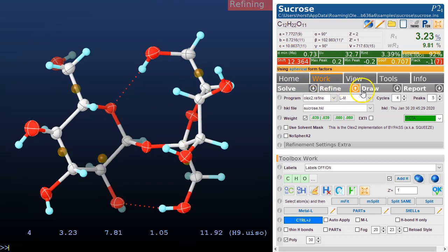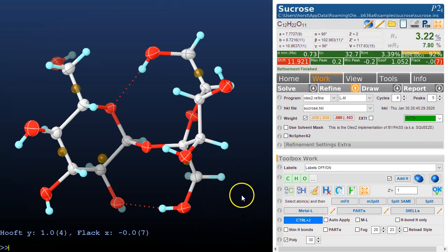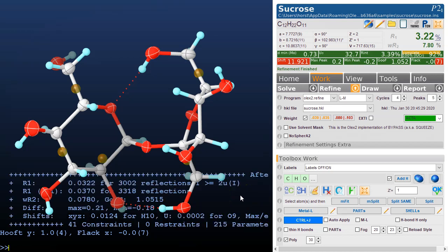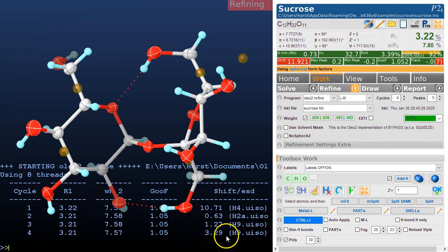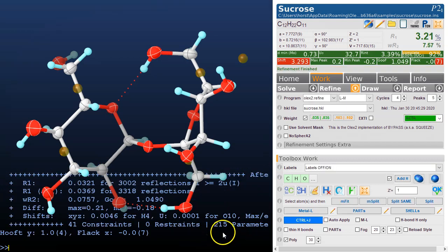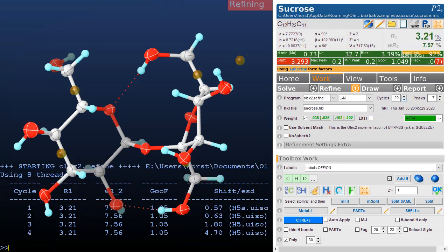If I refine this some more then the shift will hopefully disappear. I only show two or three lines of text, so if I go lines 10 then I can see 10. Let's refine this again and see what happens. There's still a shift here. I'm not quite sure. It set it to four, that's because I typed earlier on. I typed four cycles. Of course here we want more like 20.